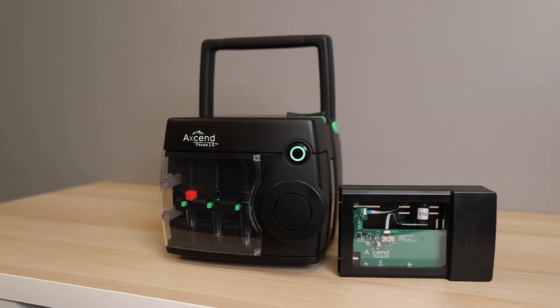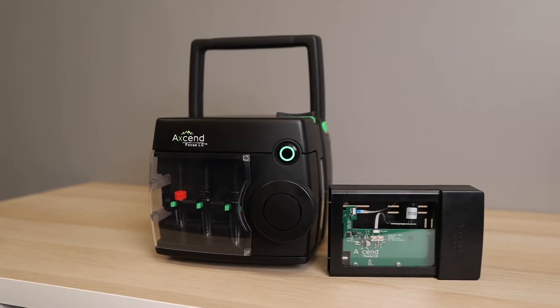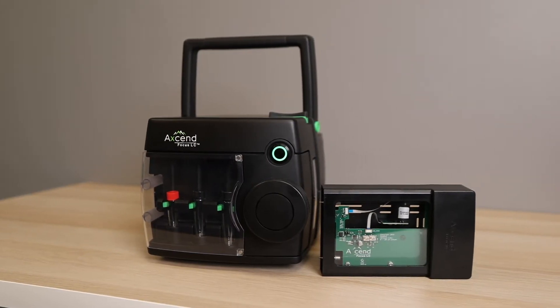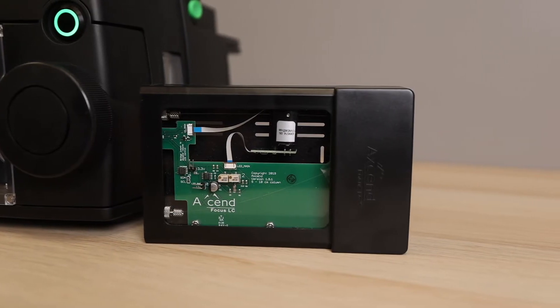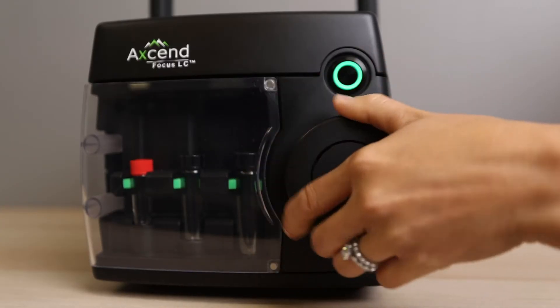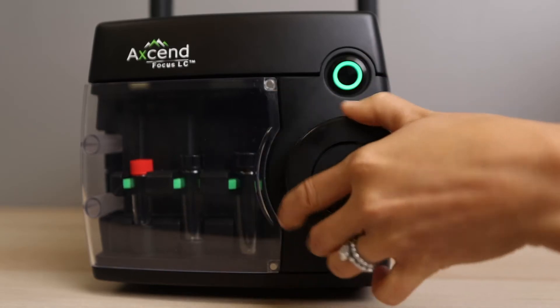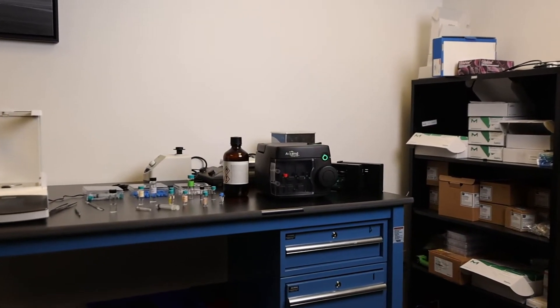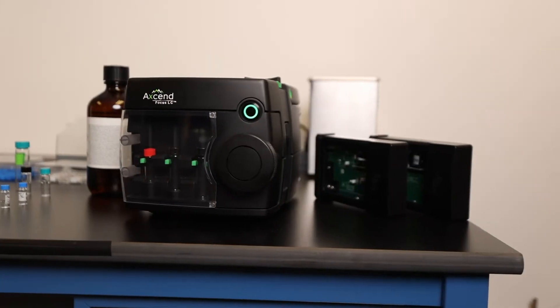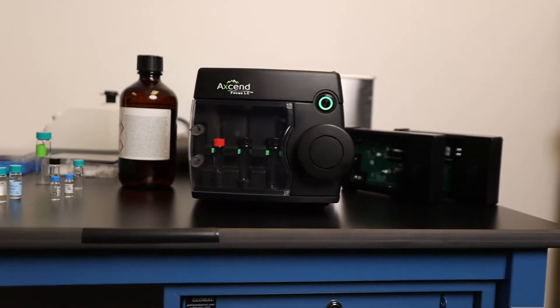From the moment you see the handle of the Axcend Focus LC, you realize this is something different. This is a remarkably small and lightweight go-anywhere HPLC that facilitates point-of-care or point-of-need analysis while delivering comparable results to traditional, more expensive systems. With its compact size, you will be able to free up valuable bench space or place it in a lab where conventional systems simply do not fit.